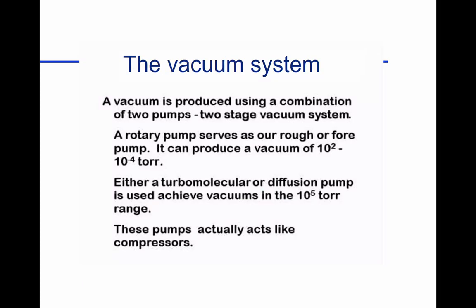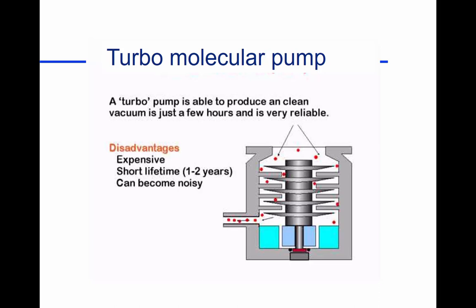The vacuum pump, as I said, there's two different pumping systems. We've got what we call a roughing pump, gets us down to 10 to the minus 4 millimeters. And then we go down to 10 to the minus 5th, 10 to the minus 6th with the more modern pumps, let's say. And this is simply a turbo pump. And so this turbo spins about 55,000 revolutions per minute. That sucker's turning, and it does that 24 hours a day for years on end. But basically, it takes air and it'll move it out through these plates and dispose of it.